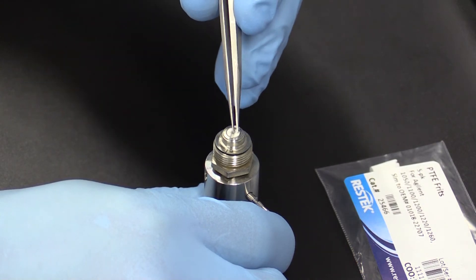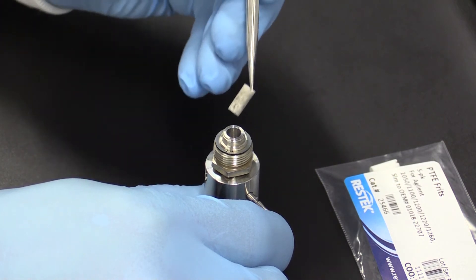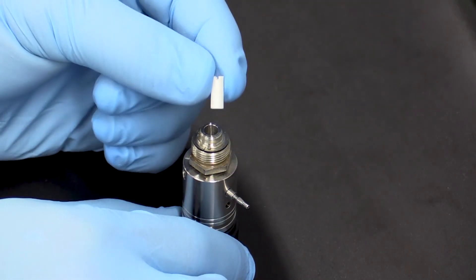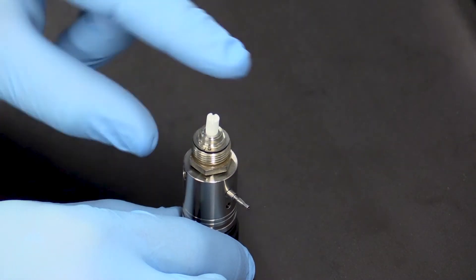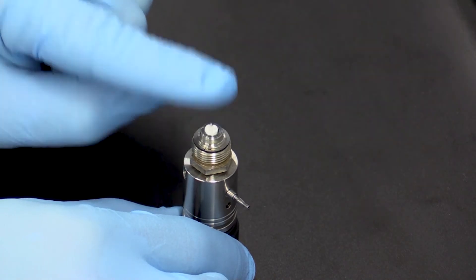Use the tweezers to remove the existing frit. Install a new frit with the slotted end pointing up. This ensures that the area of the frit with the most surface area is facing the direction of solvent flow.